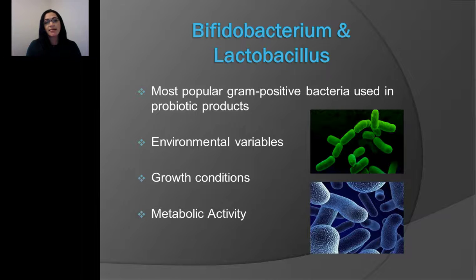So sometimes we will have to leave the Bifidobacterium plates for an extra day. This way we can see the colonies and have a more accurate count. And this is challenging, because when we have a blend, let's say a raw material sample that contains Bifidobacterium and Lactobacillus, we would have to treat this sample differently than our average sample. Because of that, it's a little trickier to differentiate between the 2 of them.